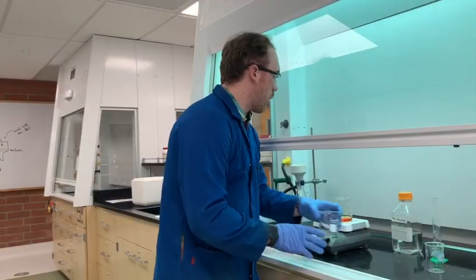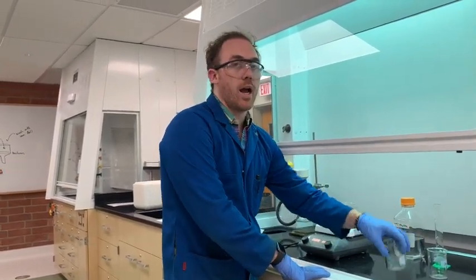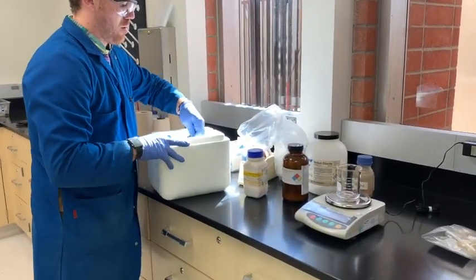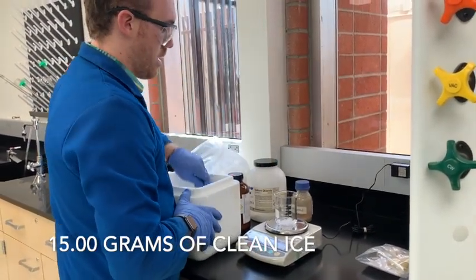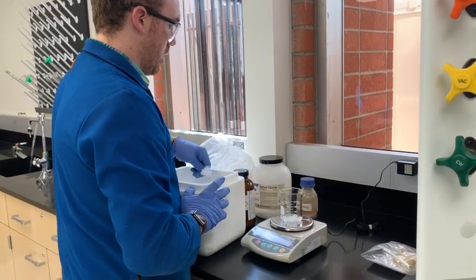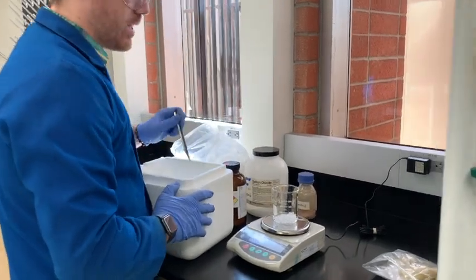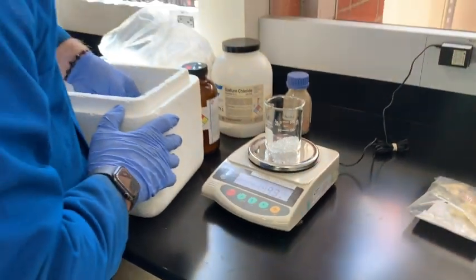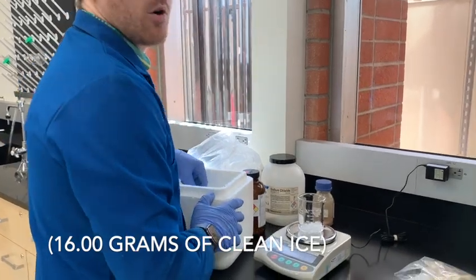Cool. Well, so what we're going to do now is we're going to take this mixture and pour it into some pre-weighed ice and hydrochloric acid. And I'm going to get myself 15 grams of ice. Doesn't need to be perfect, it just needs to be close. Ooh, there we go. 14.93, I'm pretty proud of that. Give myself a little bit more. More is more when it comes to this kind of stuff. Oh, 16, that's totally fine too. Just an extra milliliter of water.